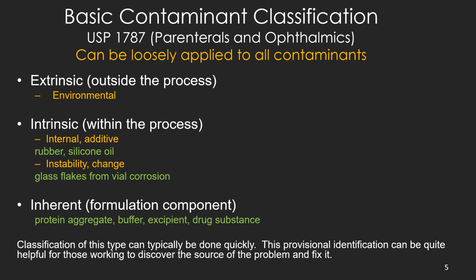Extrinsic being outside of your process, intrinsic being part of the process, inherent being part of formulation, as we call it with pharmaceuticals, but part of whatever it is that you're making. So the classification of this type can typically be done reasonably quickly, in some cases before you do your verification of what the identification is.